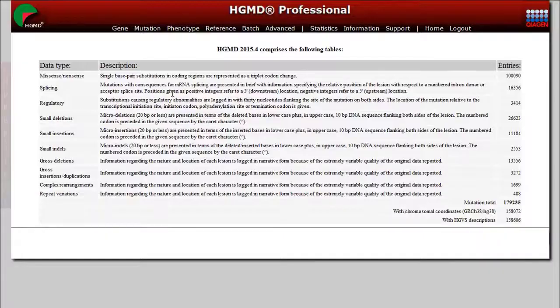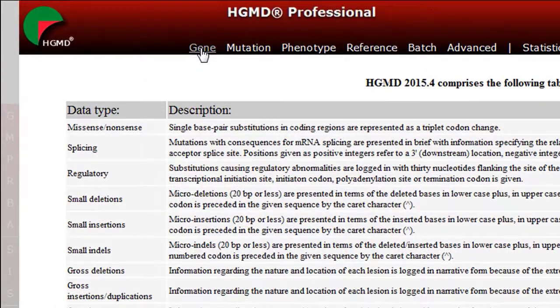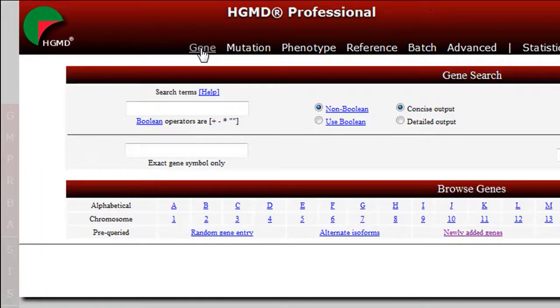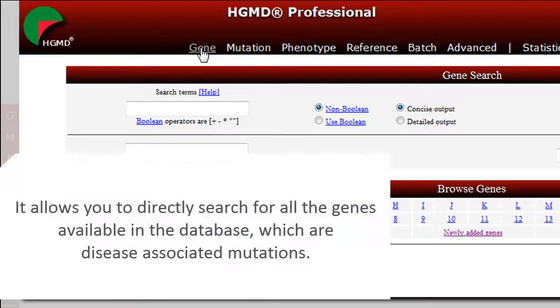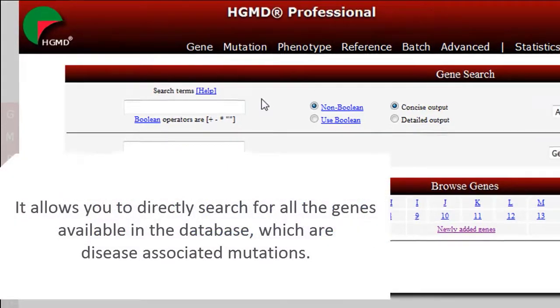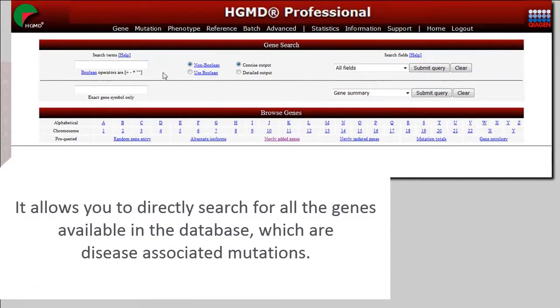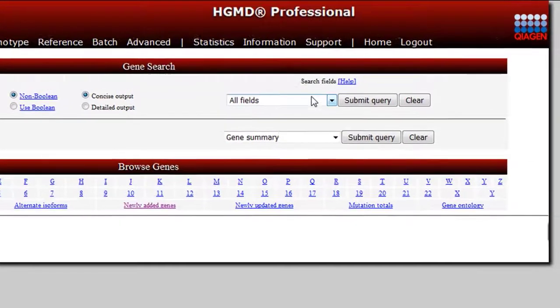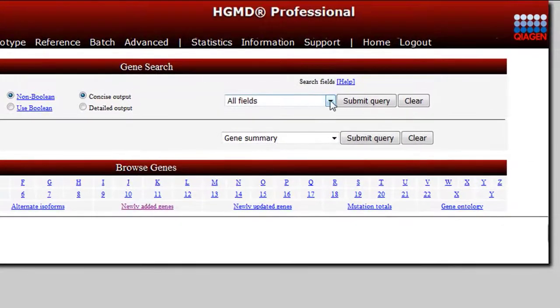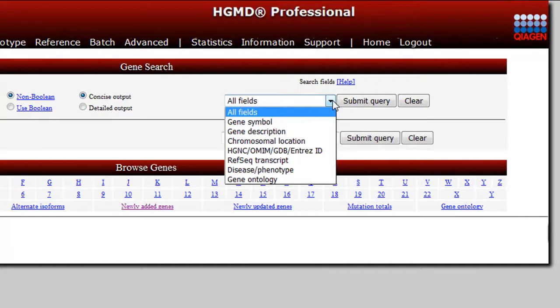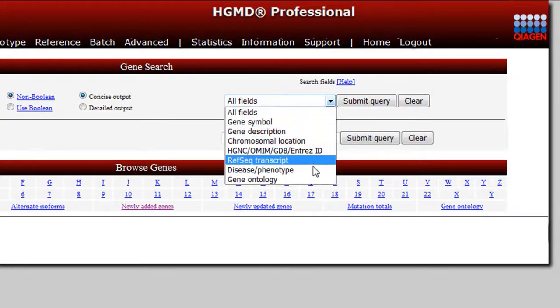The Gene Search button is accessible from the main menu here. It allows you to directly search for all the genes available in the database, which have been recorded from the literature as candidate genes with disease-associated mutations. There are seven different gene-oriented search options available for the primary gene search, accessible from the drop-down menu here.